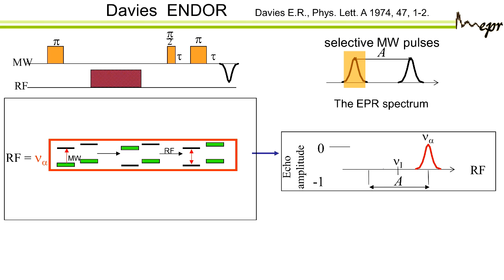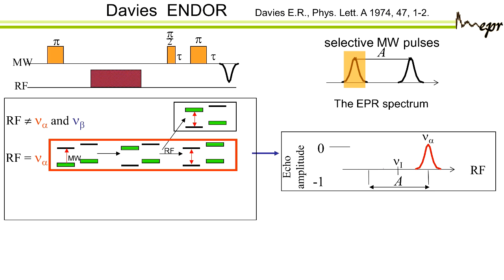Yeah, so it went from -1 to 0. So if I go from -1 to 0, I see a peak, right? So now I scan. Okay, so this shows you what happened when the RF did not match with either the NMR of Ni alpha and Ni beta. And now I go on the other transition.